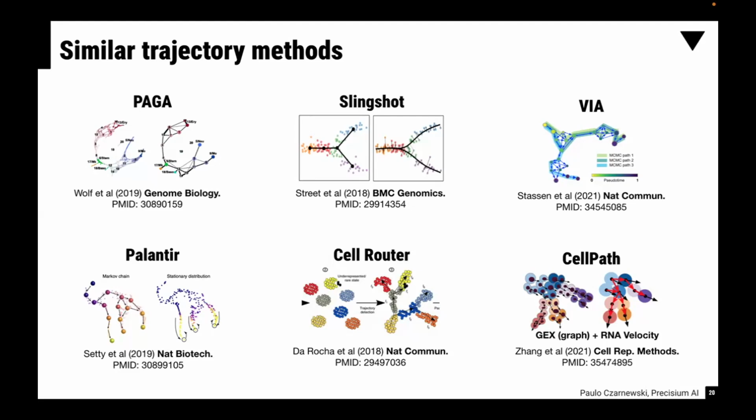Actually there might be other progenitors. For example, if you're not looking at the bone marrow and you're looking just at the blood, you only have the mature ones. So you would assume that maybe one goes to another, but that actually doesn't happen. So in some cases that might not hold true.